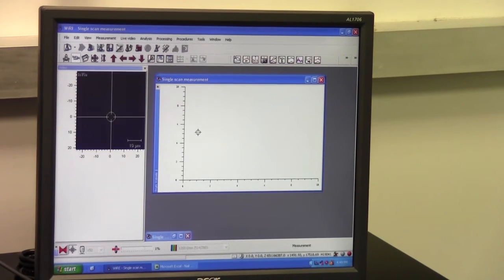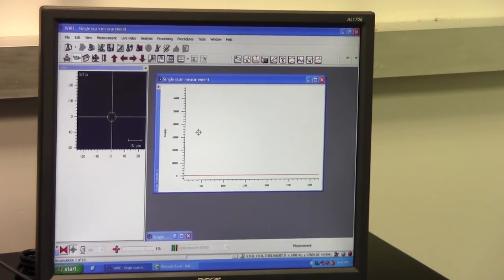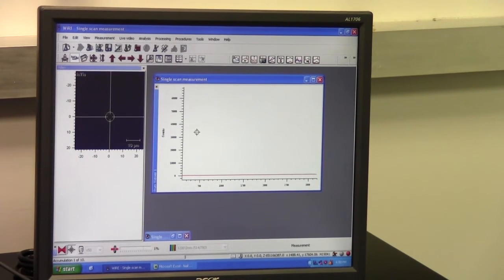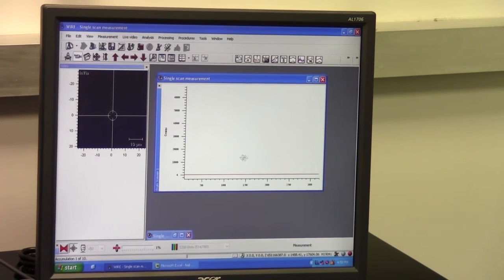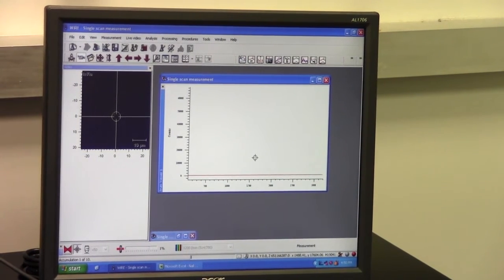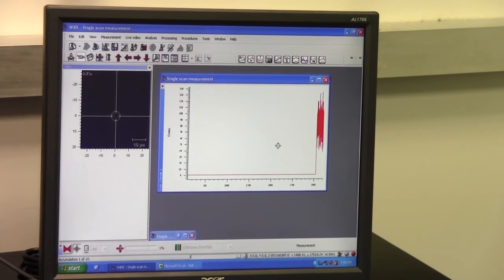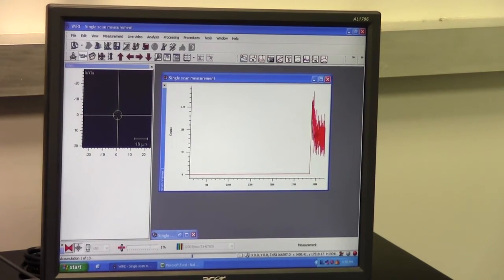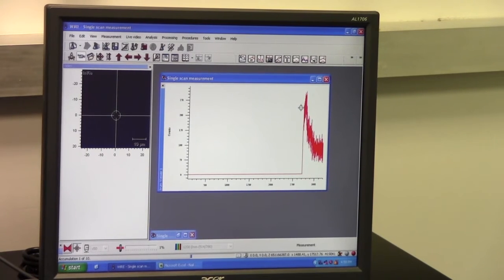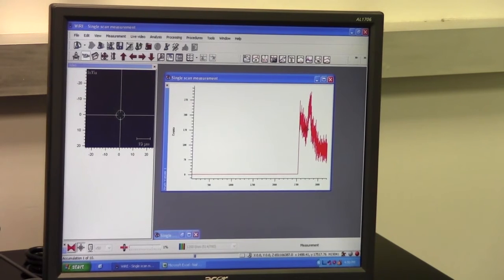After placing the sample and when the Raman laser scans it, this is what you see. As the Raman scans, you're going to see some peaks on the screen and those peaks are the fingerprints of the molecule. You see the Raman is scanning. You see this peak? That's the signature of a particular molecule. This is a fingerprint.